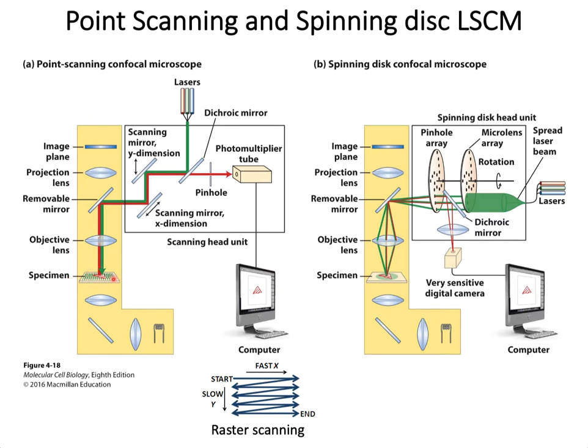Each of these single points will have a value on the X and Y axis. So basically, using these mirrors, the laser scans the image, say on the X axis, all the way from the left to the right. When completed, it will shift one point down on the Y-axis and start all the way from the left again, all the way to the right, just as shown in this schematic.